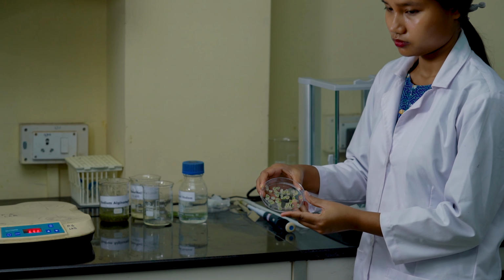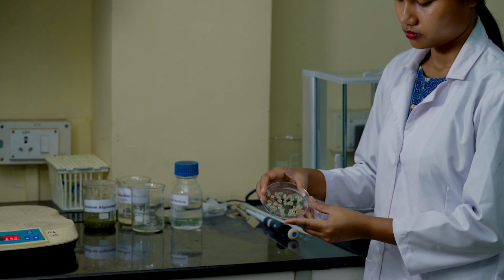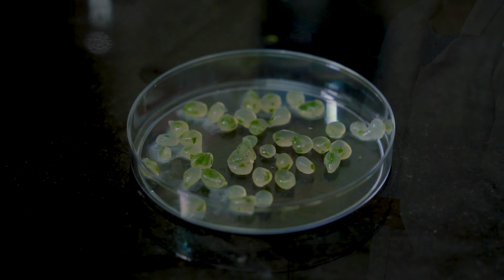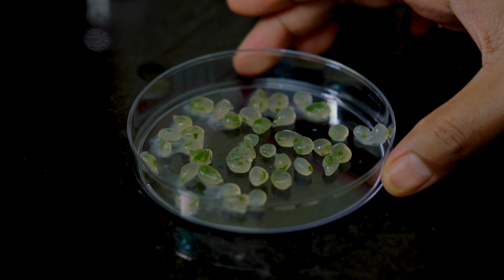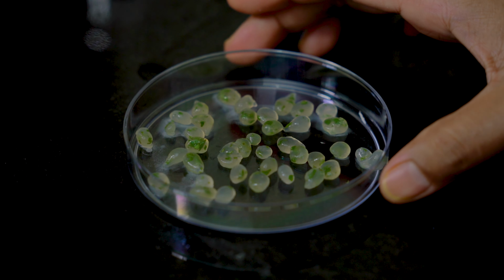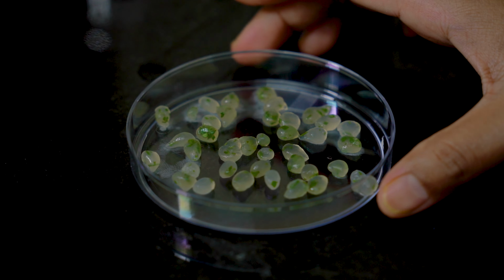Properly formed beads will be firm to touch and will not stick to each other. One can plant the seeds in different types of substrate such as agar gel medium at 0.75% and sterilized soil.